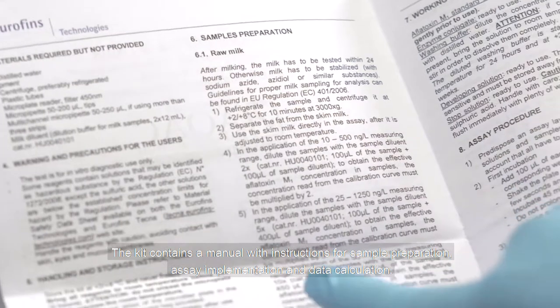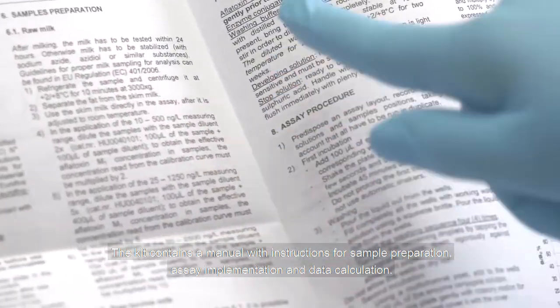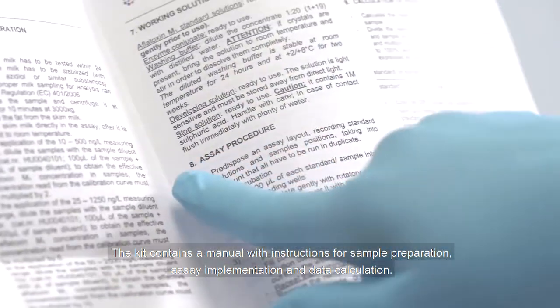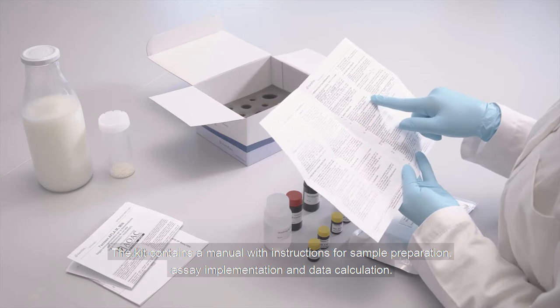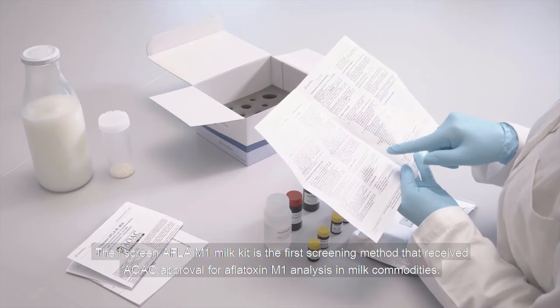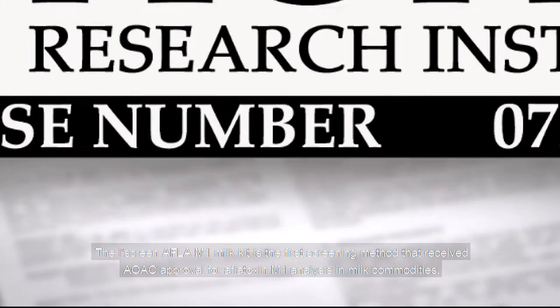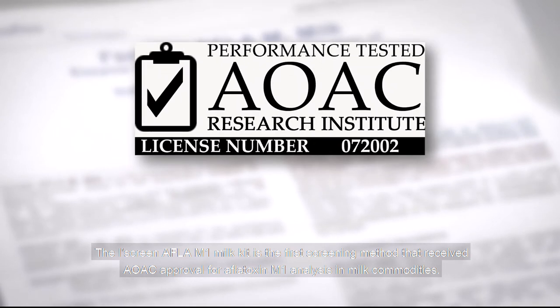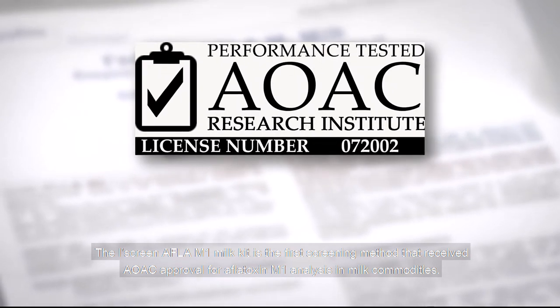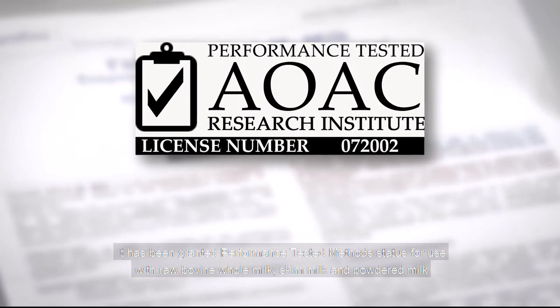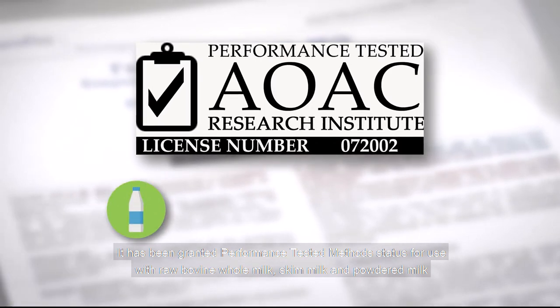The kit contains a manual with instructions for sample preparation, assay implementation and data calculation. The I'screen Afla M1 milk kit is the first screening method that received AOAC approval for Aflatoxin M1 analysis in milk commodities. It has been granted performance tested method status for use with raw bovine whole milk, skim milk and powdered milk.